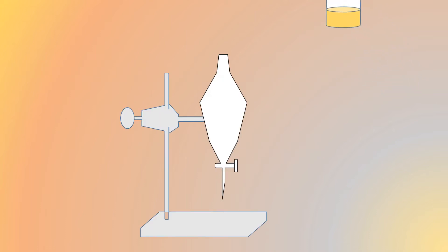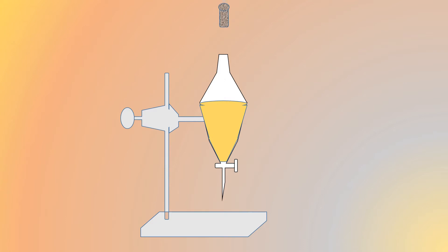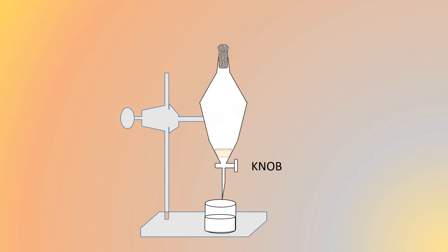Take a separating funnel and add a mixture of oil and water. After adding, close it with a rubber stopper and allow the separating funnel to settle. The oil and water will form distinct layers. Then open the knob to allow the water, which has settled below, to flow out. Only the oil will remain in the separating funnel — this is how you separate them.